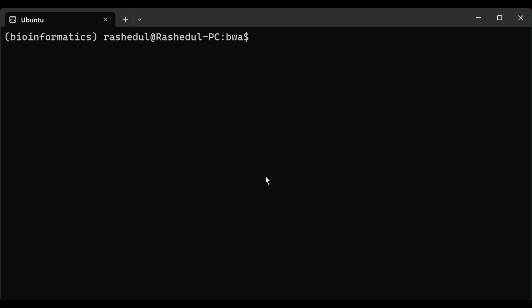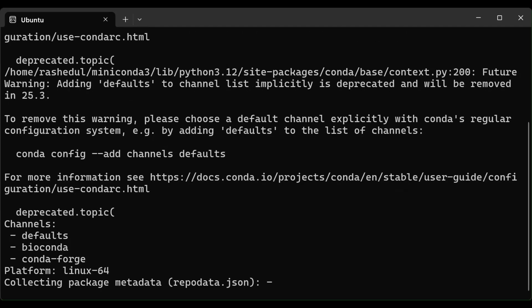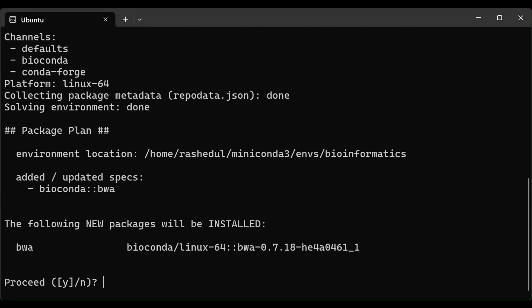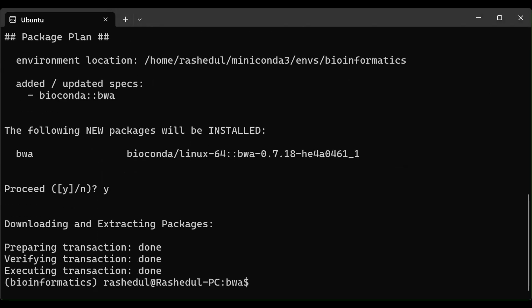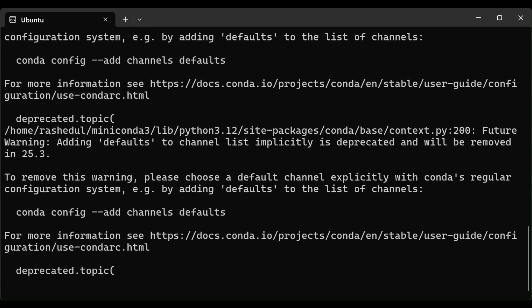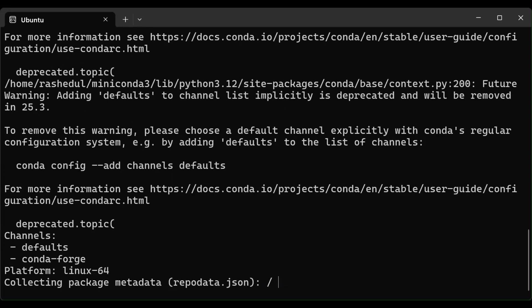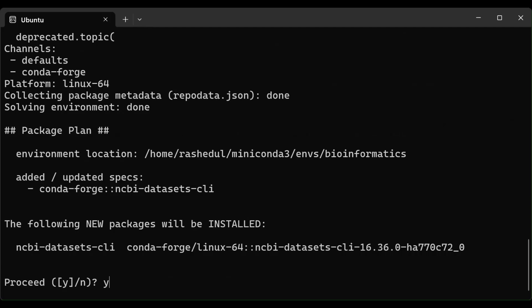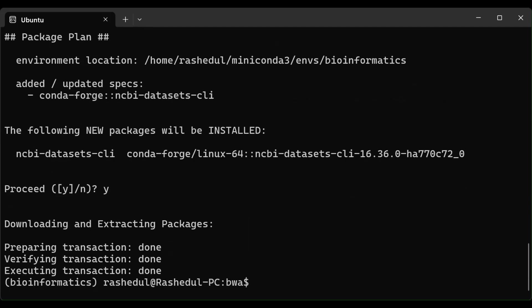First, we will download BWA software from Anaconda using this command, and type yes to install. Then we will install the NCBI datasets command line interface from Anaconda using this command. I already have SRA toolkit installed so I will not reinstall it.